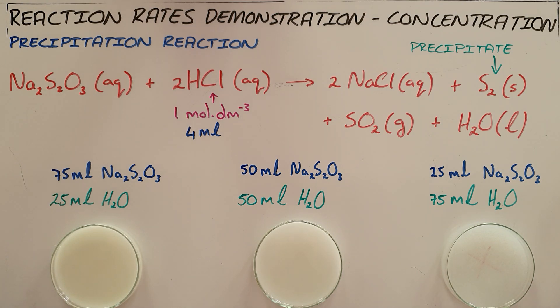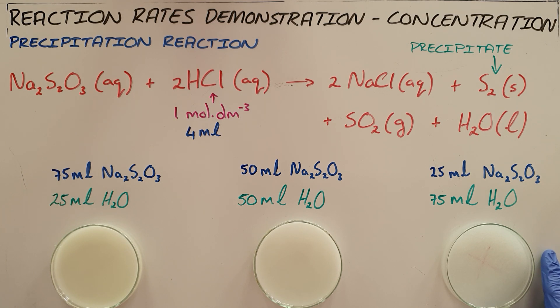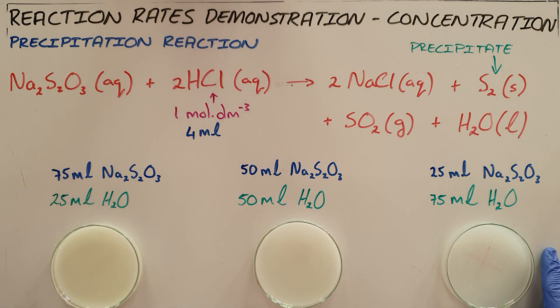We can now see that nearing the end of the reaction, the X marked at the bottom of the least diluted sodium thiosulfate solution has all but disappeared, once again showing us that the higher the concentration of reactants, the greater the speed or rate of that reaction will be.